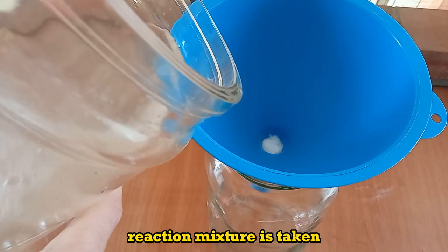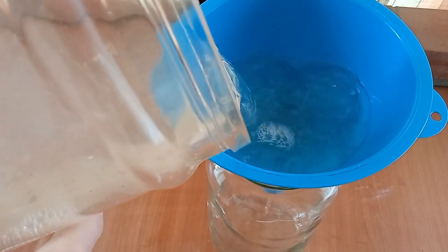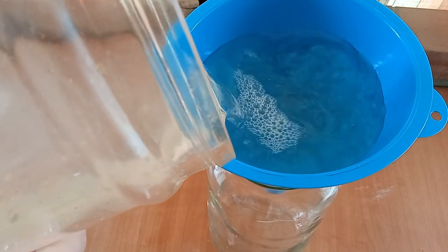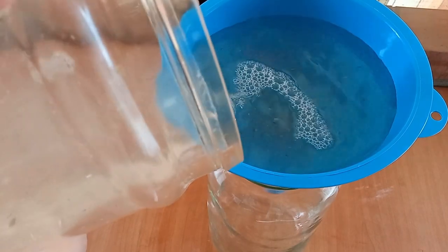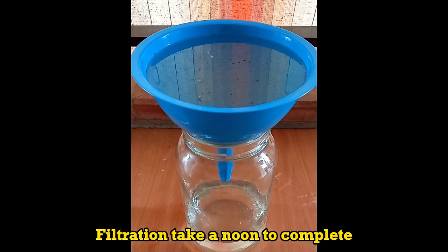Reaction mixture is taken and filtered through a cotton plug. Filtration takes a noon to complete.